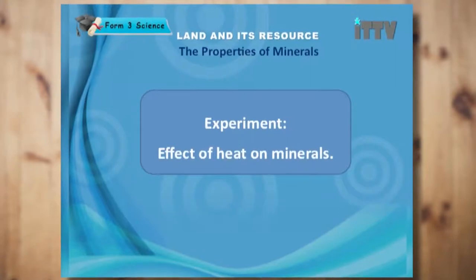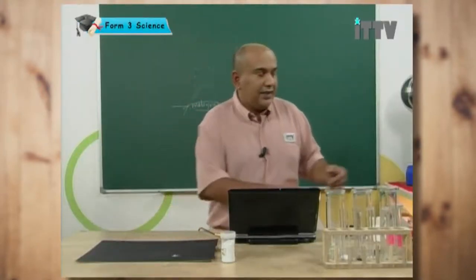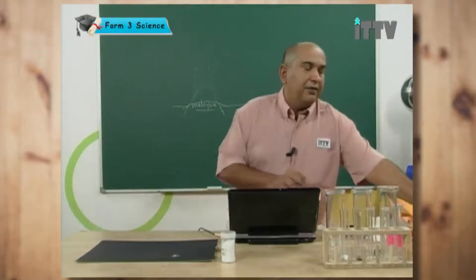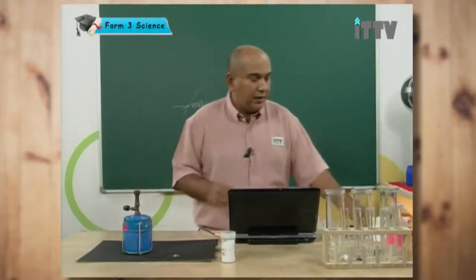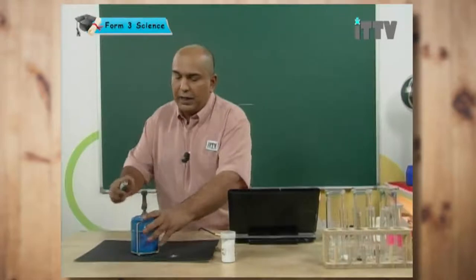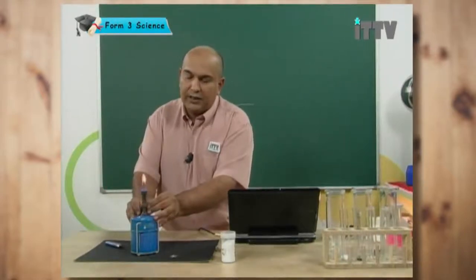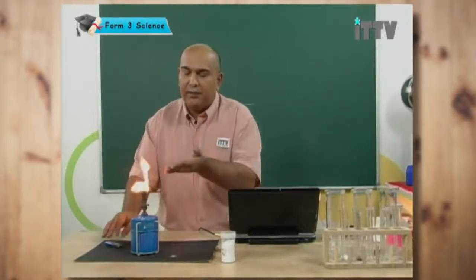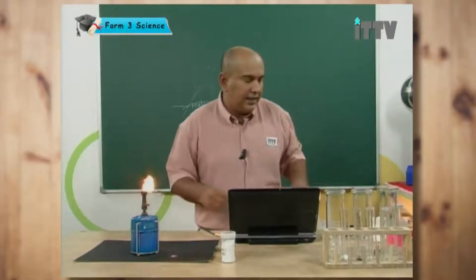The effect of heat on minerals. Whenever we're going to heat something, obviously I need the trusted Bunsen burner. So I bring my Bunsen burner out here and give it a quick light. Remember, once you've lit it, always turn it to a yellow flame so you can easily see it.